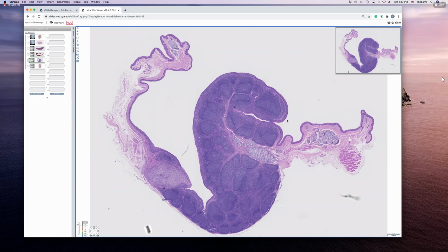Do you have any questions? I have a question. I have it written that microfold cells are in the epithelium where there aren't goblet cells. We can't see those, right? Let me see. Where is it in your text?